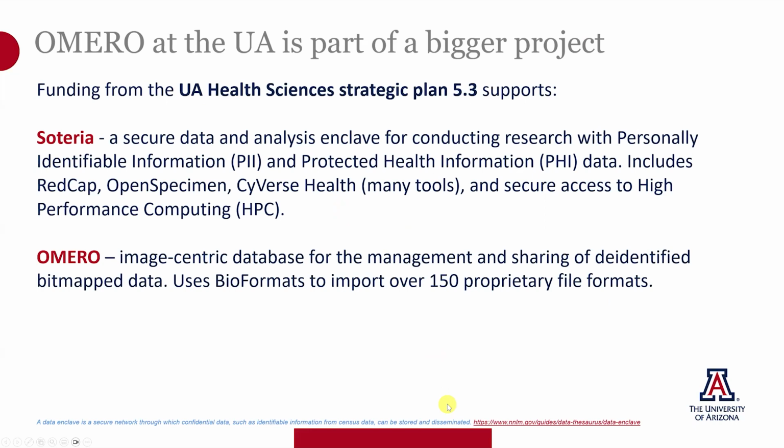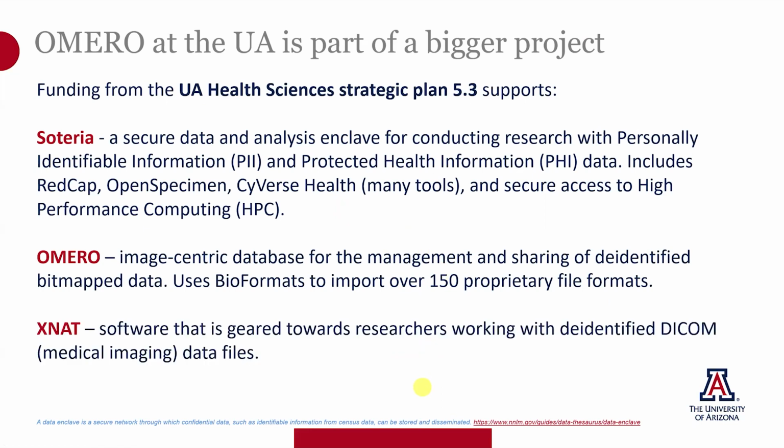Omero is, as we'll talk about, an image-centric database. That number 150 is the latest I've seen, it is now over 160. If you happen to be someone that's working with medical imaging data like MRI, CT, ultrasound that comes in the DICOM format, there is also software called XNAT that's available for people doing research in that field. And just as a side note, while Soteria is secure for working with patient-related information, Omero and XNAT do require de-identified information.